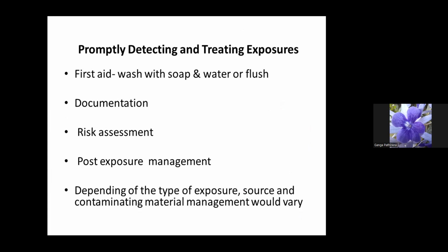So when there is an exposure, you have to promptly detect and treat the exposures. There should be first aid in the laboratory. As first aid, you can wash with soap and water or flush. Then you have to document the incident, and you have to assess the risk by the risk assessment team, and then you have to do the post-exposure management. Depending on the type of exposure, source and contaminating material, management would vary.